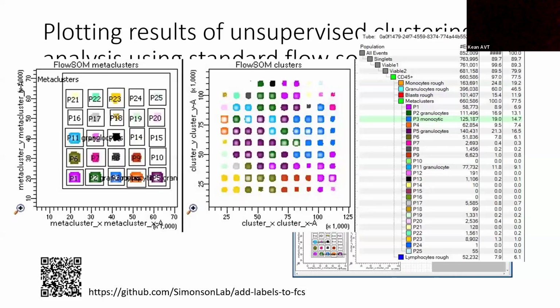So we can actually just add a little jitter or noise to those coordinates, and the dots are basically big enough for us to see in our flow cytometry software. And then we can just draw gates around those nodes in the grid. So we can basically use all the functionality of the flow cytometry software that's already there. So it's just a simple way for us to switch back and forth between cluster label and our traditional gating, and so we can directly compare.